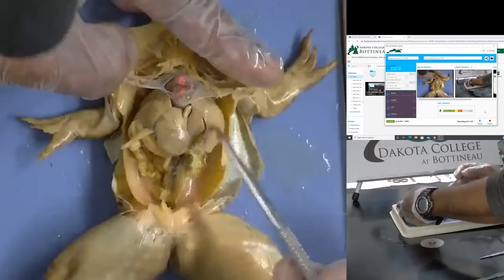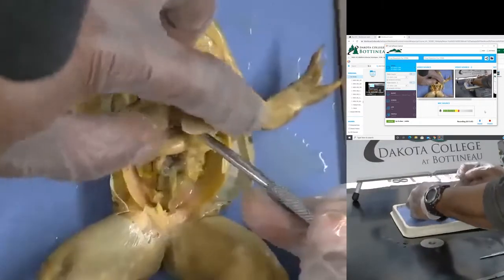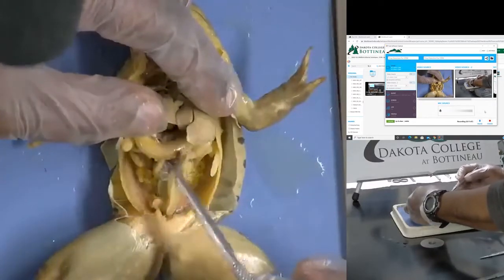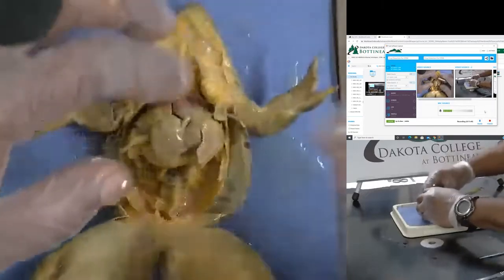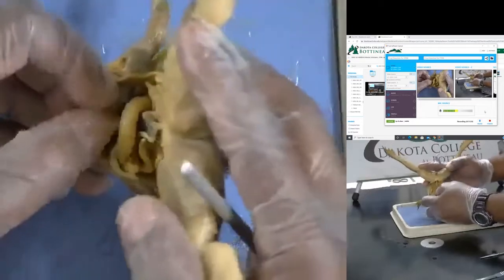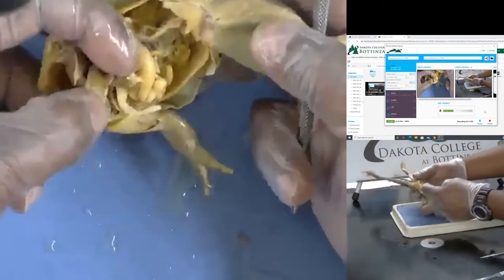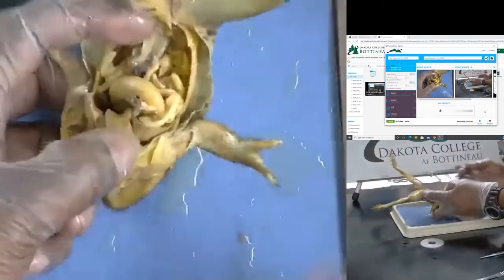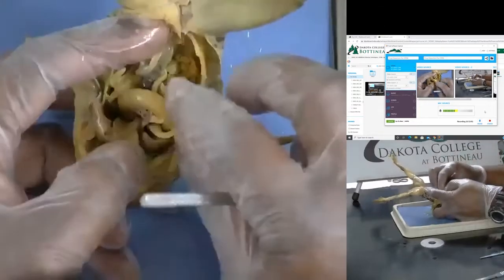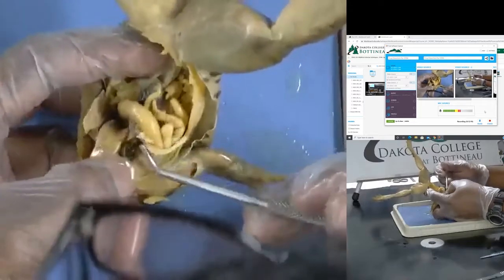So that's your liver. If I lift the liver slightly, what you're seeing there, this worm-like structure right there, that's the stomach. Okay, that's the stomach right underneath it. I'm lifting the liver, kind of pointing underneath it. I'm stretching this side out. And right underneath it, okay, here's a fat body that's in the way. Right underneath it, this sac-like structure you see, it's kind of greenish.